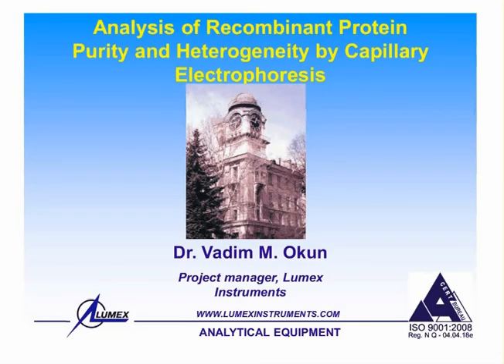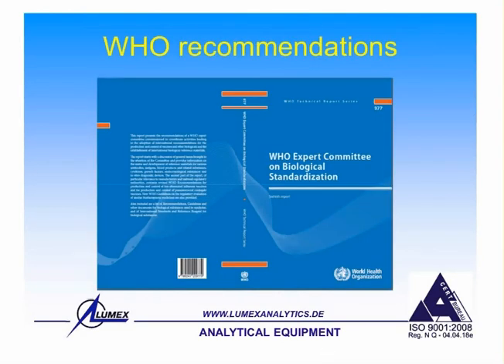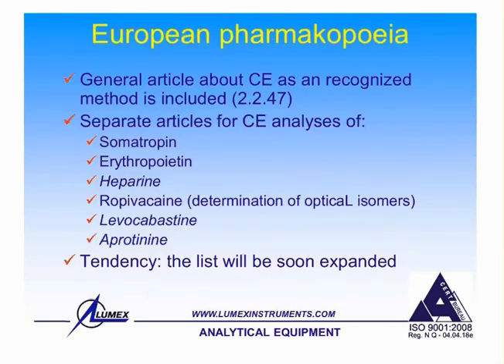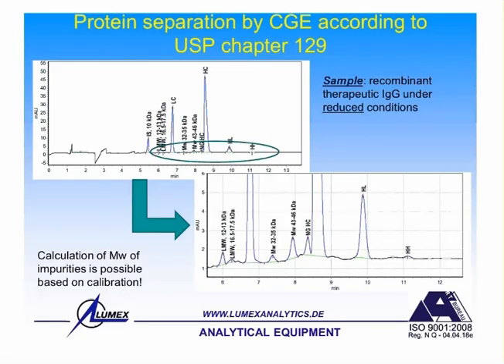Let me show you the slide. Just a second, I will show you everything. For example here, look at this slide. It's the same separation we have on the bottom part of the slide. We have a zoom of what we see on the upper trace.